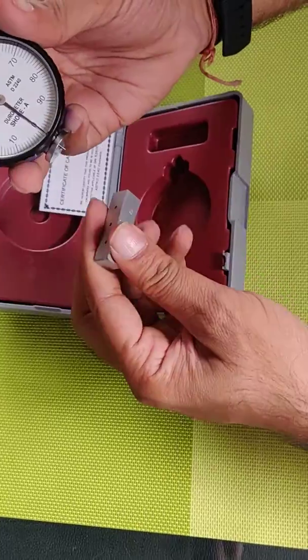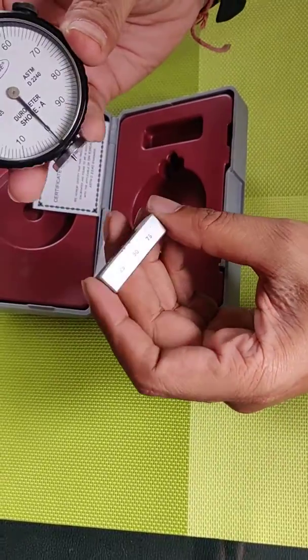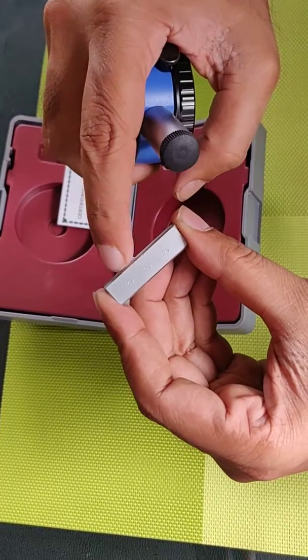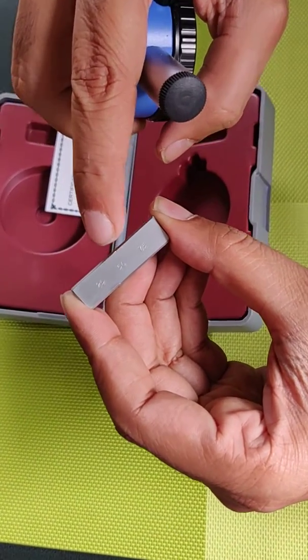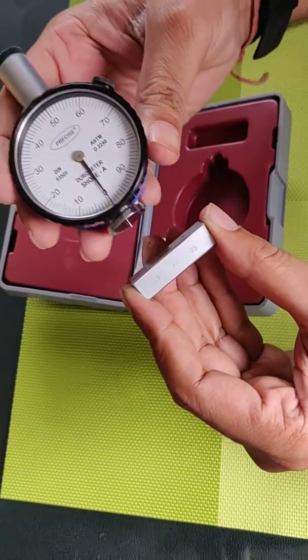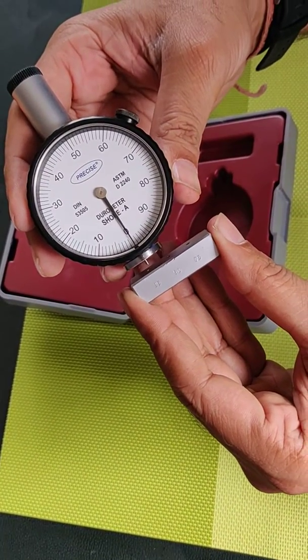And you also have a test block to check whether it's giving you the right reading or not. So we have three readings here: 25, 50, 75. We'll check and show you whether it's giving you the right reading or not.